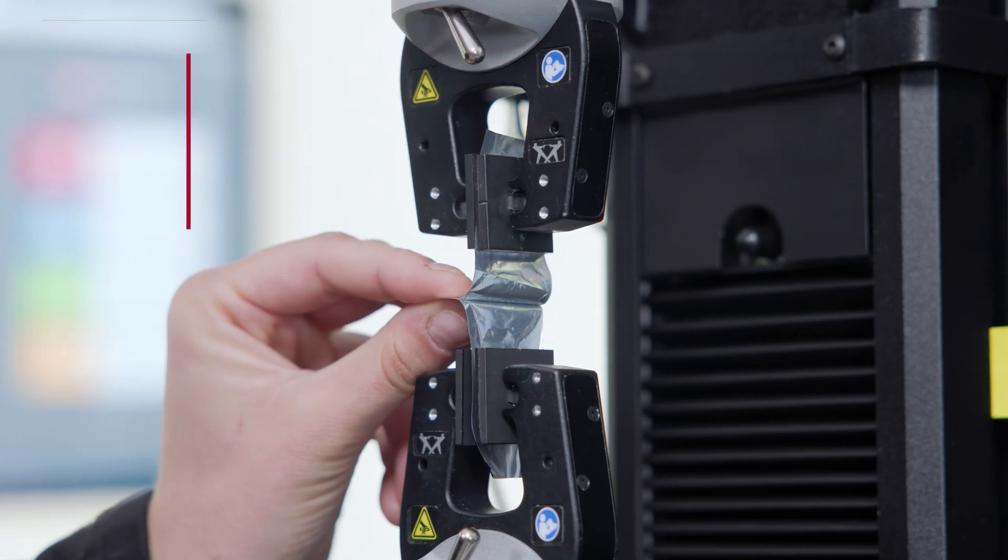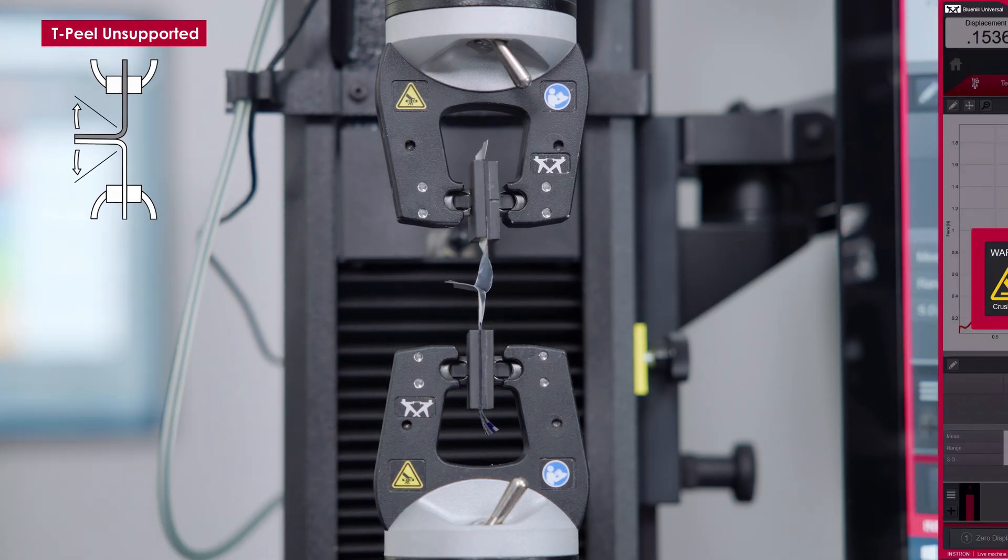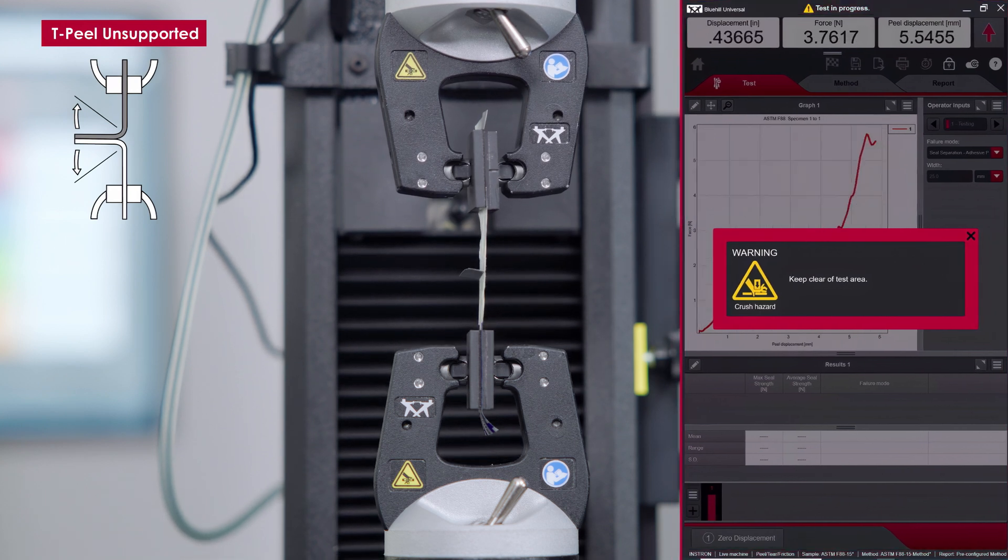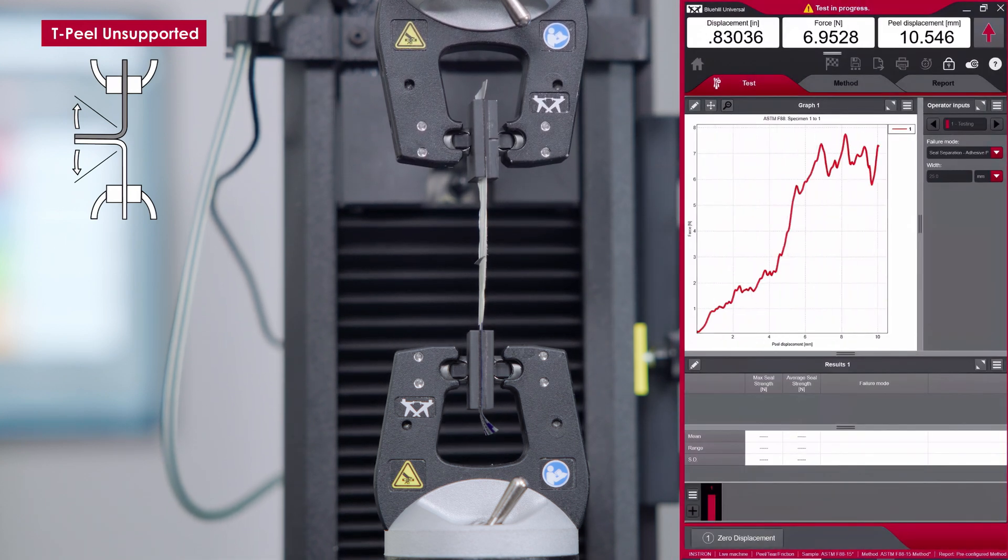For T-peel testing, each tail of the specimen is secured in opposing grips and the seal remains unsupported during testing.